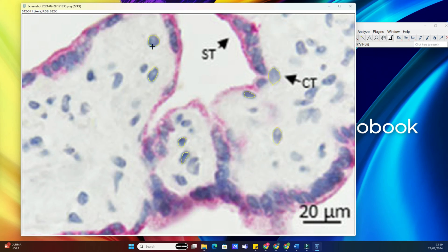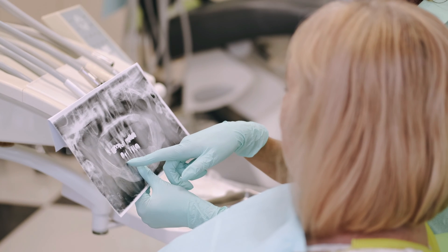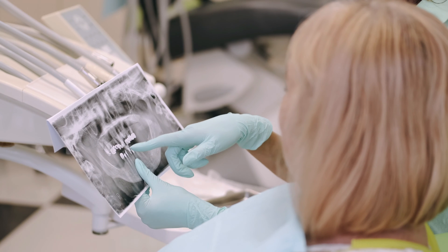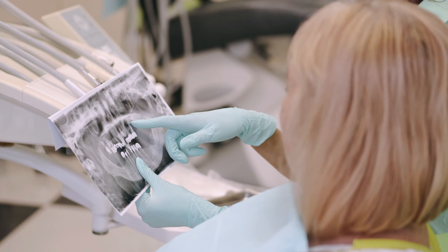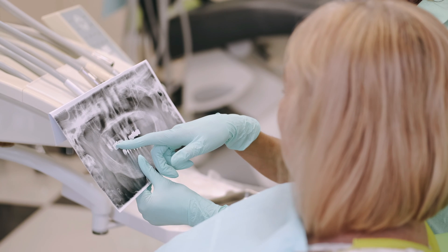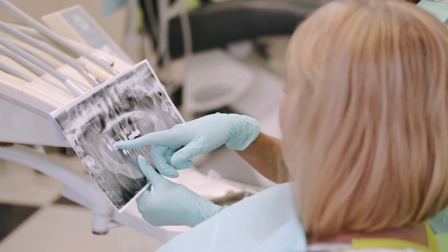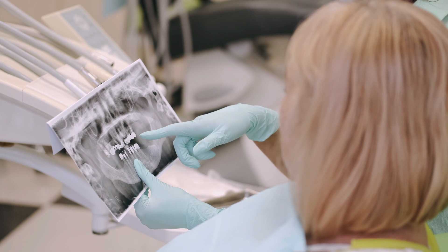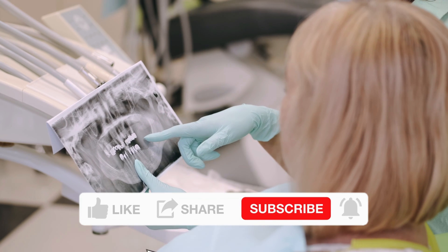But wait, there's more. ImageJ also allows us to perform various measurements and analyses on these selected regions. Whether it's calculating area, intensity, or any other parameter, ImageJ provides a plethora of tools to analyze our data with precision. And there you have it, folks. By mastering the art of selecting multiple regions of interest in ImageJ, you'll streamline your image analysis workflow and unlock new possibilities in your research. Thanks for tuning in.